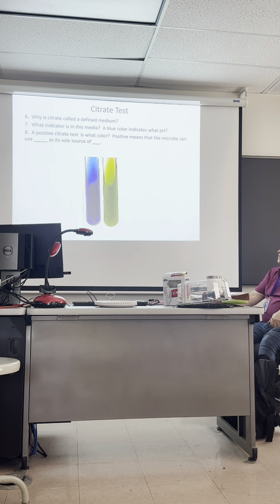So a positive citrate is what color? Blue. A positive means that the microbe can use something as its sole source of something. Citrate as its sole source of? Carbon.